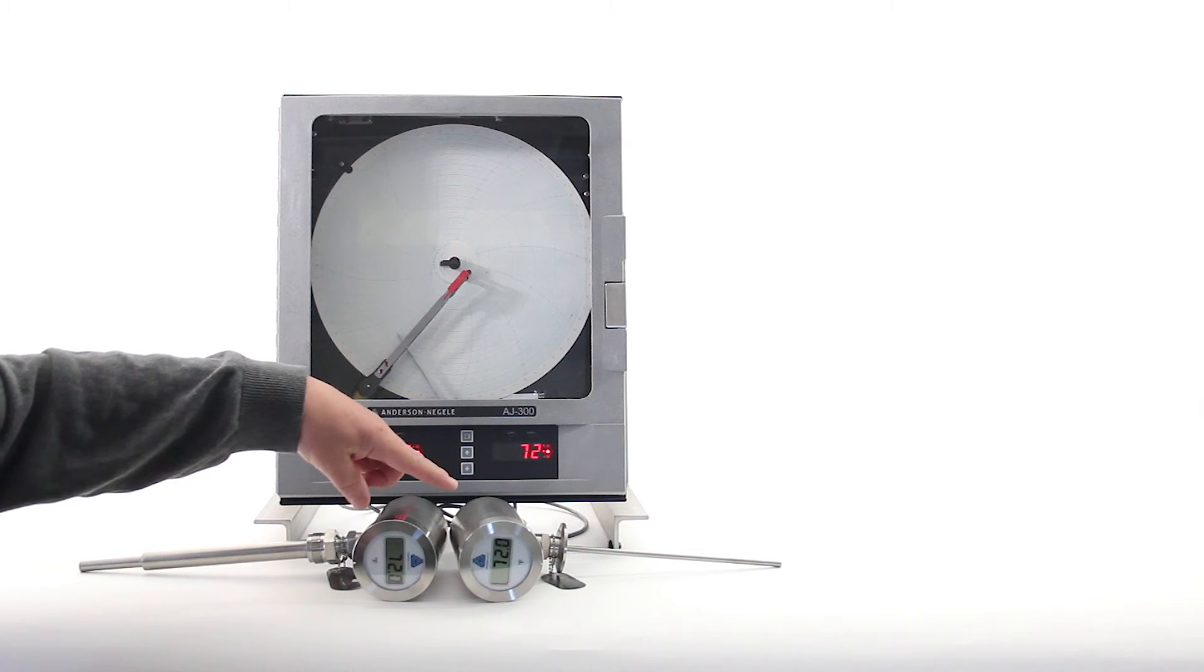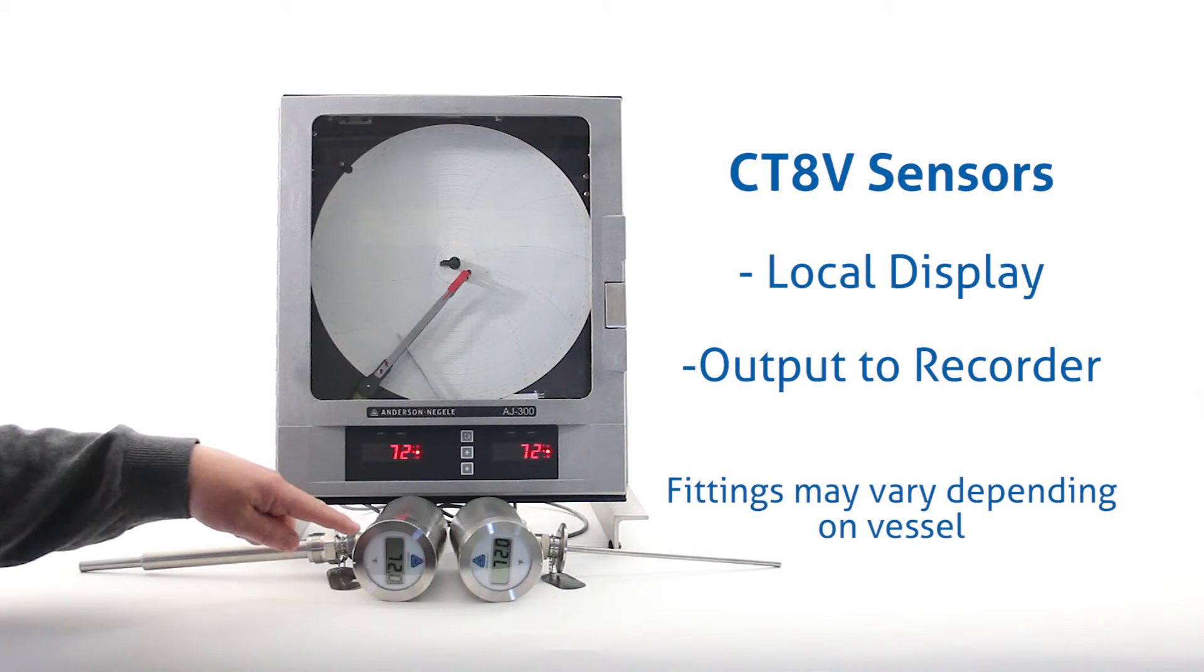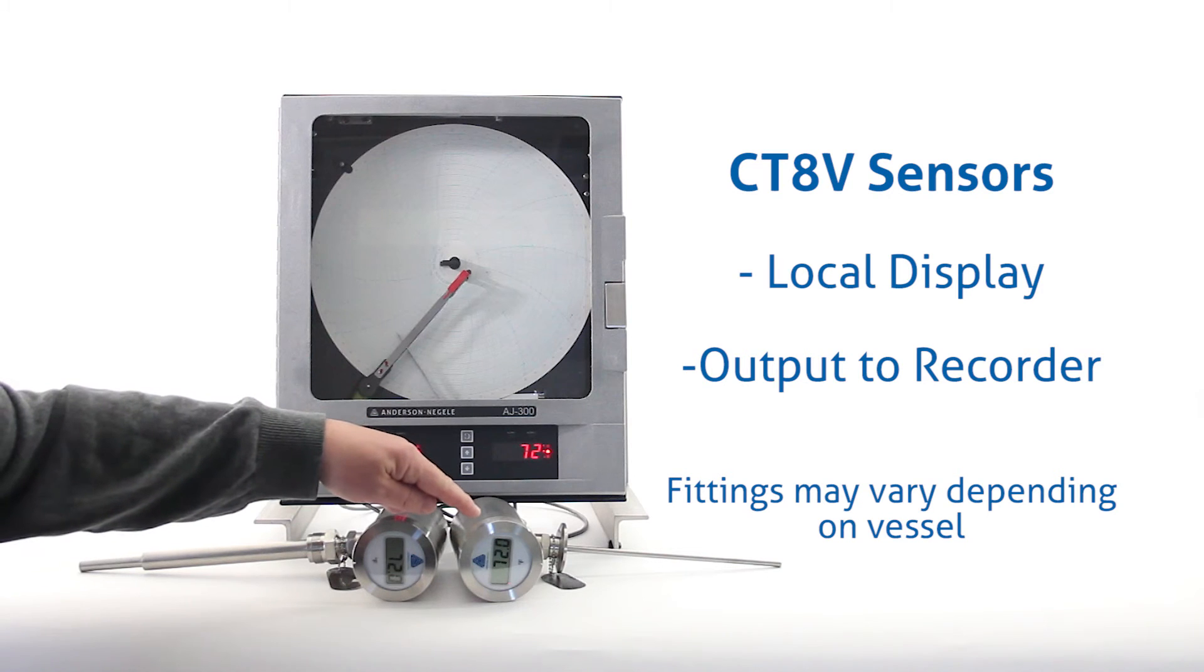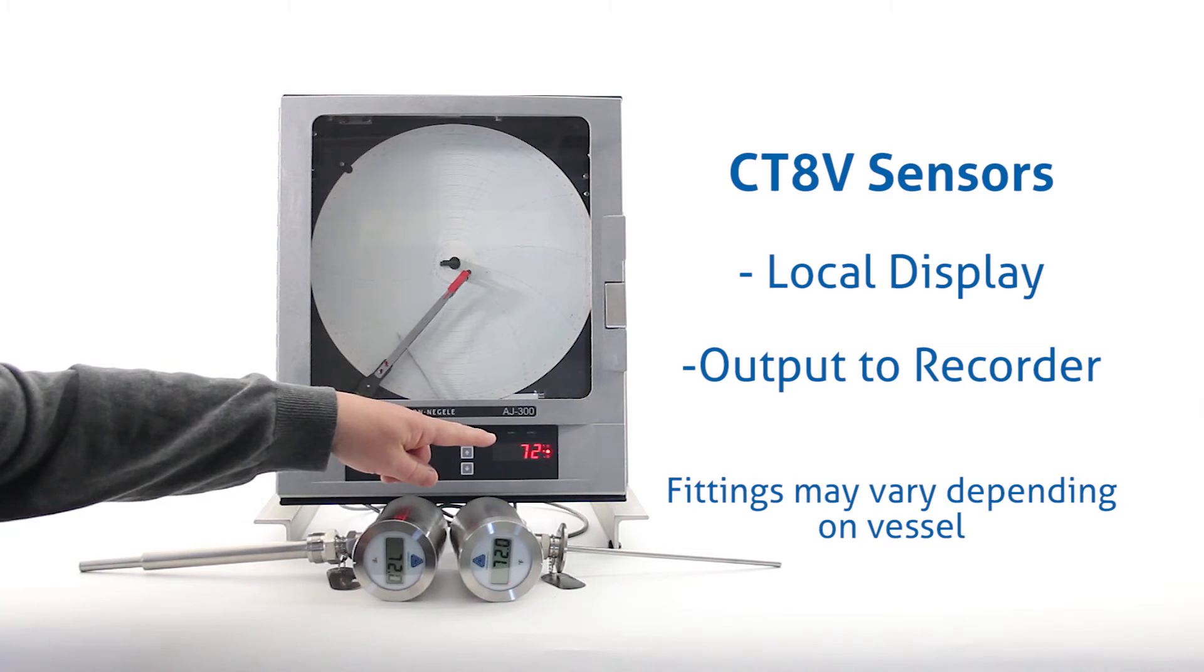Next, we have the two CT8V sensors. The product sensor provides a local display of the product temperature and sends a signal out to the recorder. The airspace sensor provides a local display of the airspace temperature and also sends a signal out to the recorder.